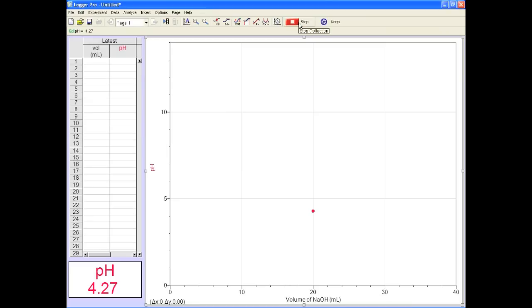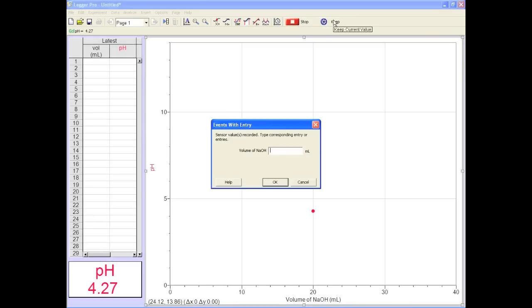Press collect and notice the keep button is now lit up. Press it and enter the amount of titrant you've added to your sample. 0.00.